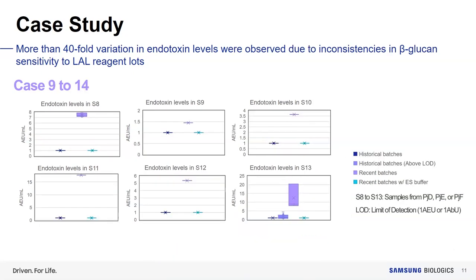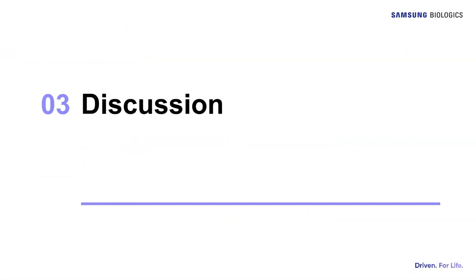Six additional cases show similar trends to the previous cases. Variations in LAL reagent beta-glucan sensitivity are not consistent, and can result in repeated false positive reactions, leading to undue quality record investigations. In some cases, it may result in unnecessary product rejections and drug supply issues. This is financially critical to manufacturers and may critically impact patients if they cannot receive a drug on time.